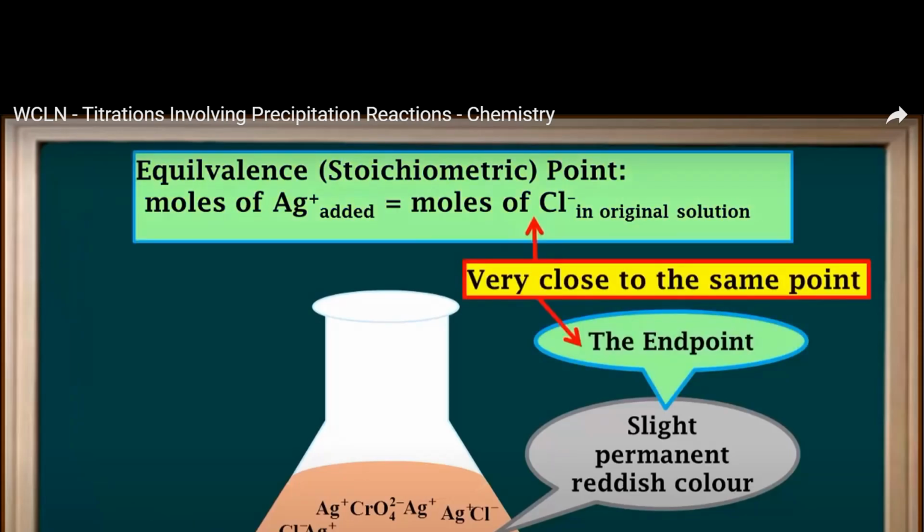In most titrations, if the proper indicator is used and the technique is good, the equivalence point and the end point are very close, and they can be assumed to be the same point. Okay, so the end point and the equivalence point, if you have chosen your indicator well, and there's a whole section in Acid Base 2 where we look at choosing indicators, and you do your technique well, then you will have a good approximation, okay?